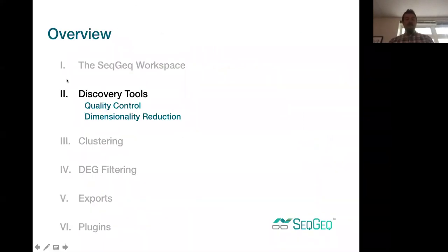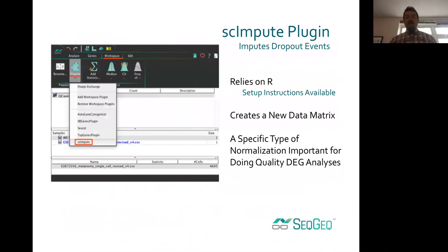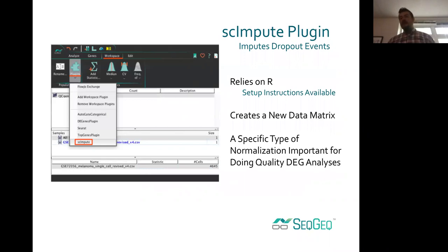Next, quality control — that's probably the next step you'll want to do before dimensionality reduction. The quality control available in SeatGeek is multifaceted. One option many people will want to run is the SCImpute plugin, which relies on R and helps to impute dropout events. In single-cell RNA sequencing data, many events are counted as zero — no reads detected — but are actually non-zero. There are various algorithms to impute those dropout events before downstream analysis.